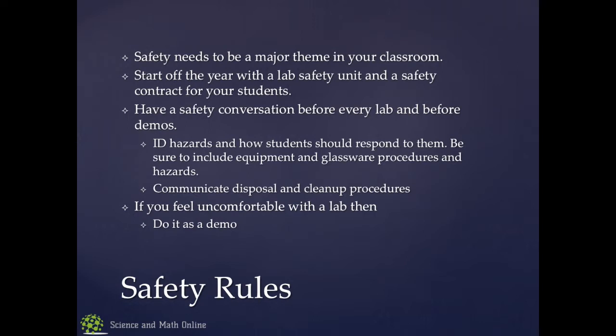Make sure you run through the lab first. Make sure it works. Make sure what kind of values they should be getting, what it should look like. You need to run through it yourself first. When you set it up, run through it. That's always helpful. That helps with that fear factor coming in. It helps you be more comfortable with it and able to teach it better. But even after that, if you're still uncomfortable with it, do it as a demo. And if you're really uncomfortable with it, just do it as a YouTube video. That is just really the simplest thing to do.